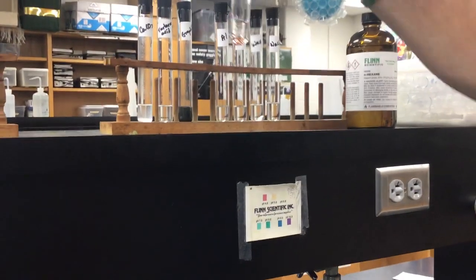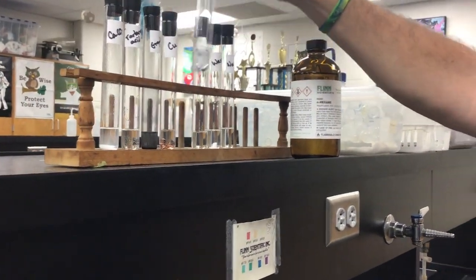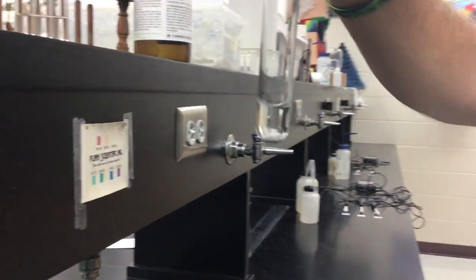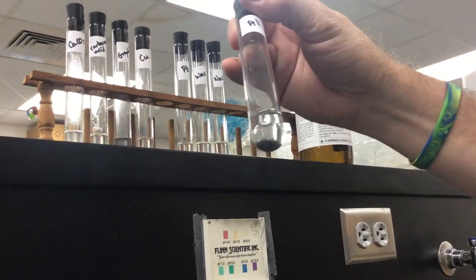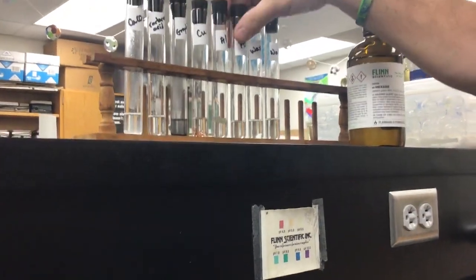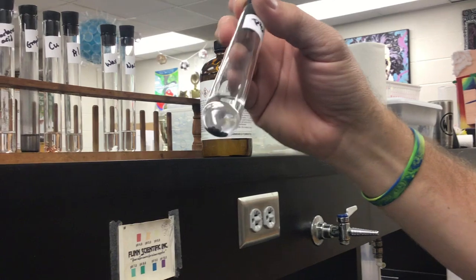And then I got the copper. Well, that's easy. You can see that. There's the copper. Looking at the aluminum. Can you see it down the bottom? Yeah, aluminum down the bottom still. Lead, probably similar. Yeah, even hear it. Little lead shots down at the bottom.